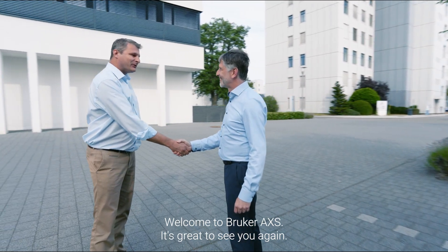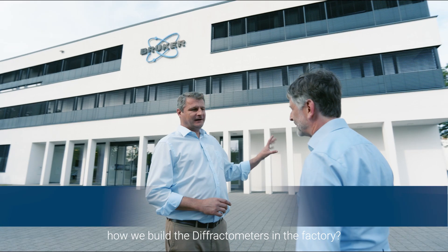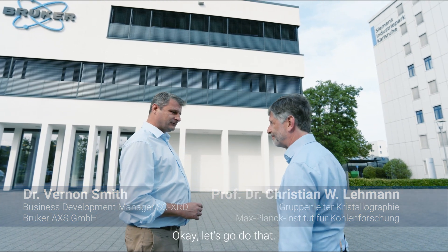Hi Christian, welcome to Bruker AXS, it's great to see you again. Would you like to go and take a quick look at how we build the diffractometers in the factory? That would be a great thing to do. Okay, let's go do that.